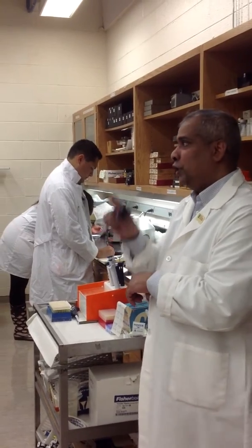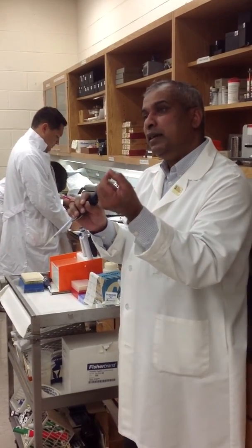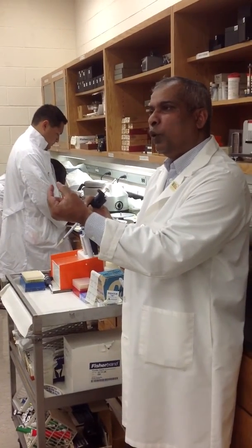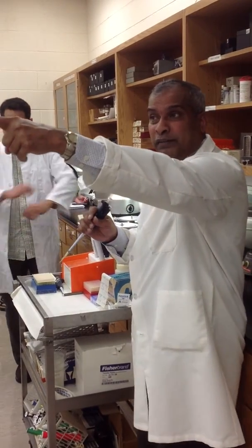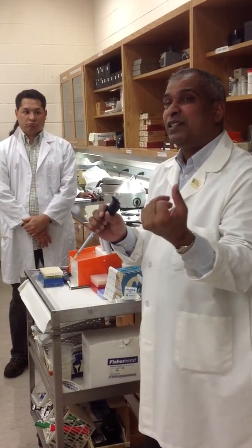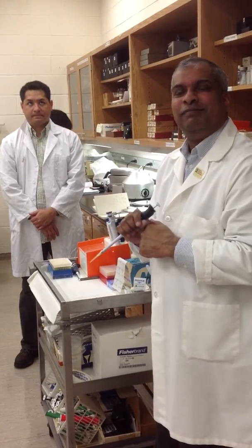Make sure you go back and look at the video on YouTube. They give you a nice explanation. They say 1 cc gives you 1 ml, and 1 millimeter cube equals 1 microliter. So when you're reporting cubic millimeter, and we're saying there's 5 million cells in 1 millimeter cube, that's 5 million cells in 1 microliter.